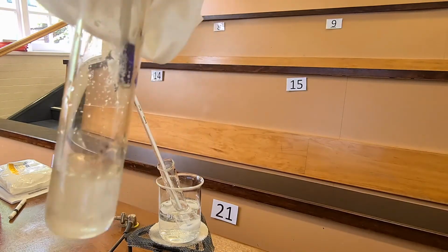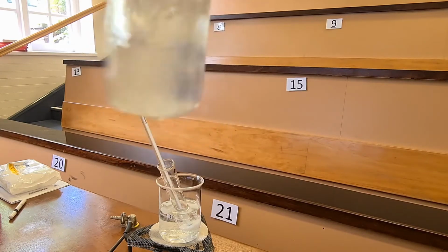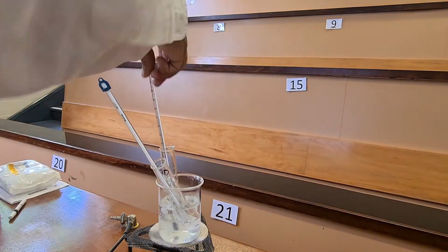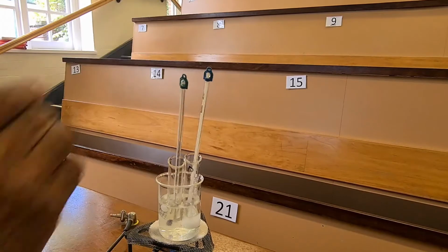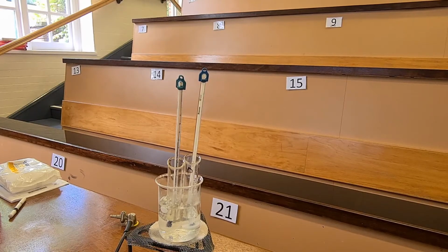Any extra solid down the side, I'm trying to get in to the test tube. Finding it hard to dissolve. Maybe I need to put it back into the hot water. And D will be harder still to dissolve. So perhaps we need to get the water a bit hotter in order to get those last two to dissolve.